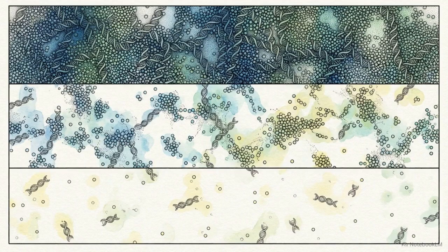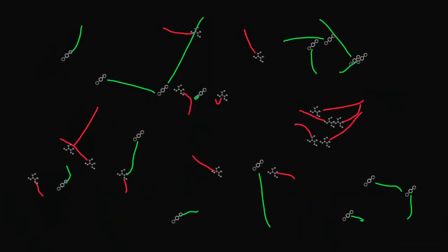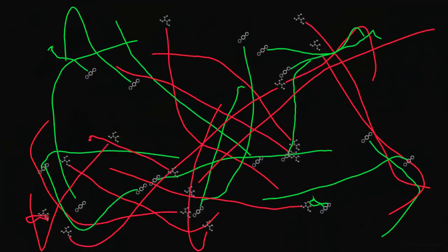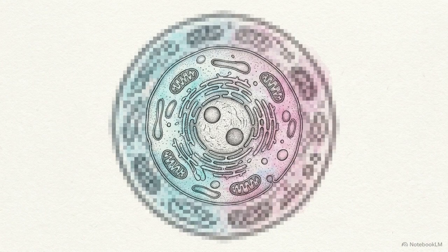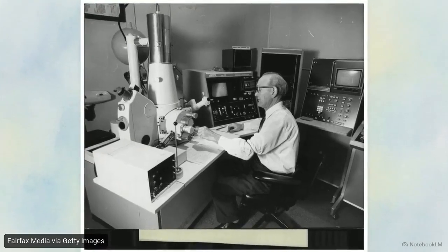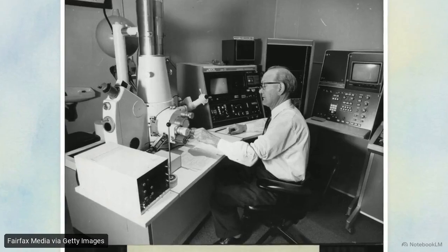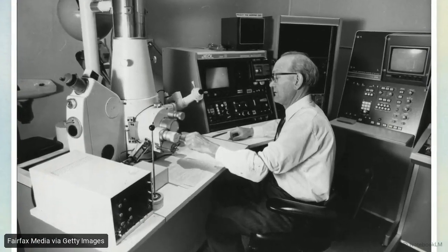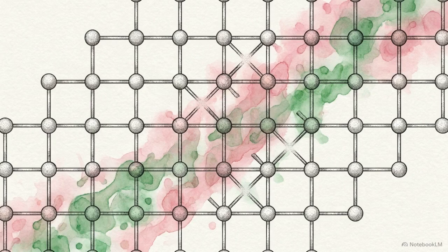Techniques like STORM, STED, and PAINT bypass the diffraction limit to expose the thermodynamic and kinetic reality of assemblies in motion. However, these methods are not a panacea. They cannot fully replace the physical, atomic density mapping provided by electron or atomic force microscopy. The new frontier of advanced materials characterization is correlative microscopy.